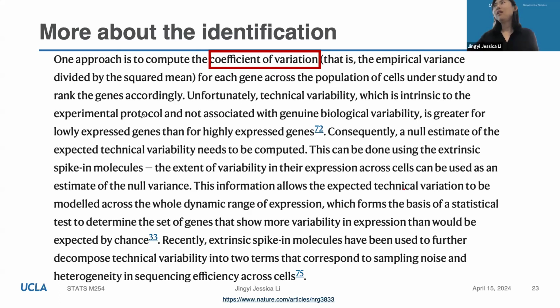Because in the bulk data, you would extract the RNA, add a spiking, right? So then the RNA from the cells, from the biological sample, is already in the solution. But in single cells, it's not the same procedure.